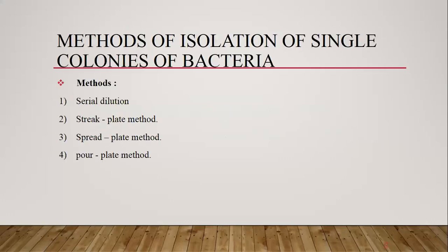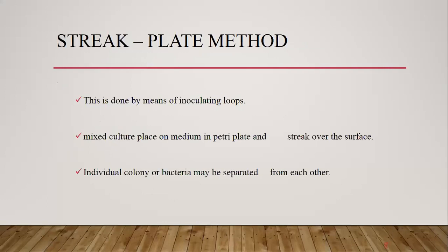To isolate these bacteria, different methods are used, which include serial dilution, streak plate method, spread plate method, and the pour plate method. Now we discuss these methods one by one. So the first method is the streak plate method.